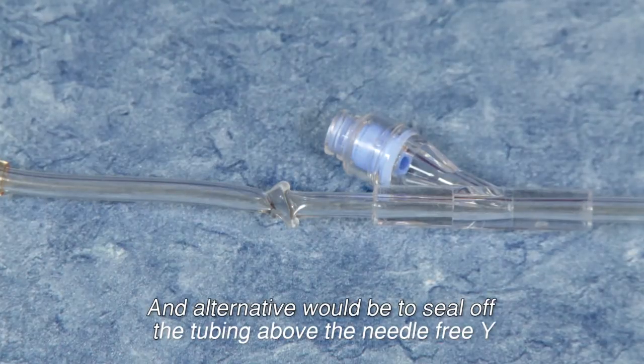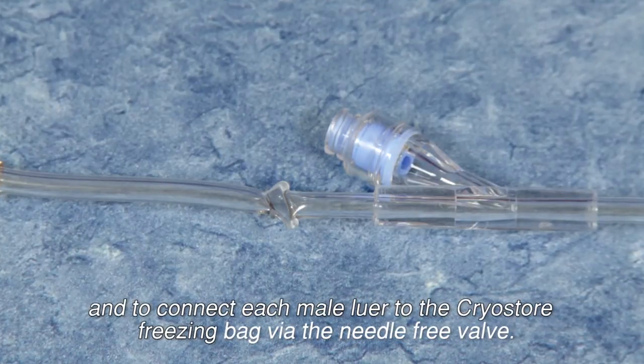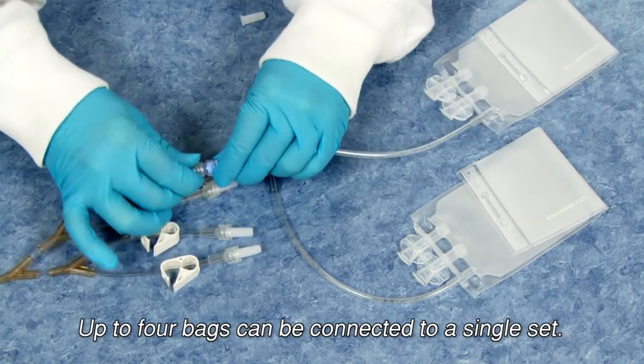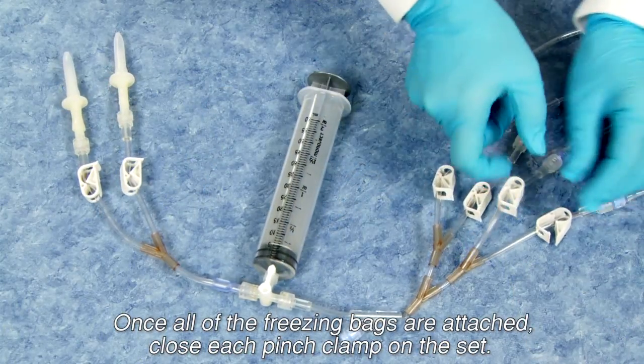An alternative would be to seal off the tubing above the needle-free Y and connect each male luer to the Cryostore freezing bag via the needle-free valve. Up to four bags can be connected to a single set. Once all the freezing bags are attached, close each pinch clamp on the set.